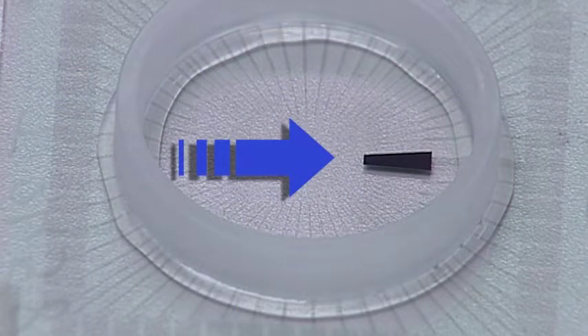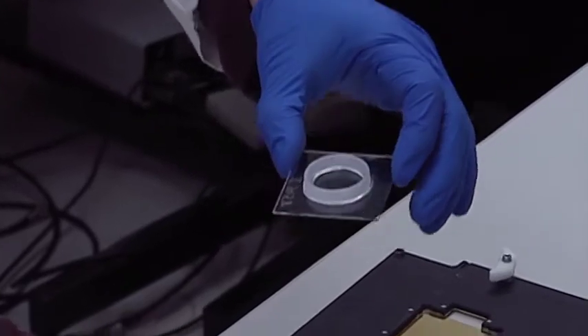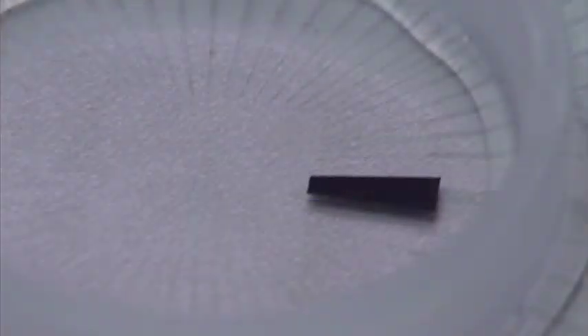A biochip is actually nothing special. It's a chip very close to a computer chip, but we put this chip into a cell culture dish to make it very clean so we can culture a cell. A chip is made of silicon, very close to glass.